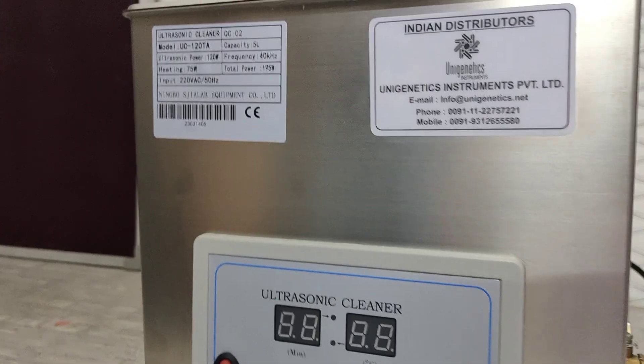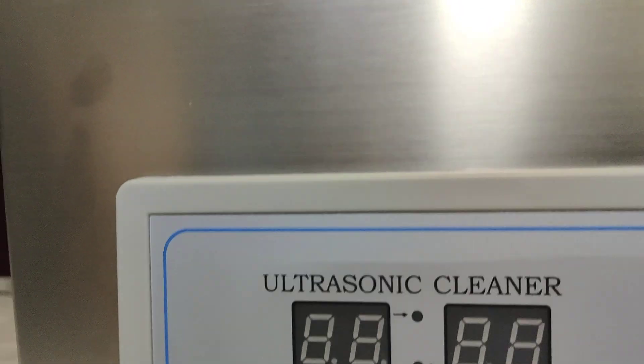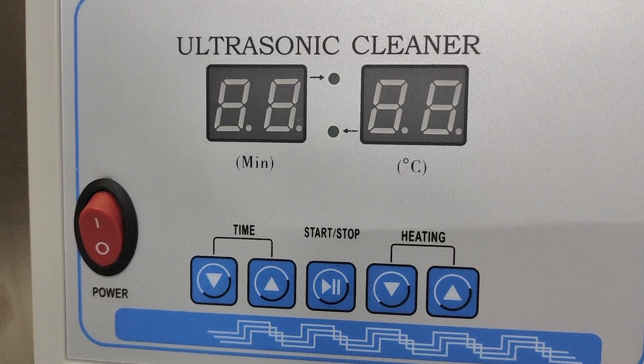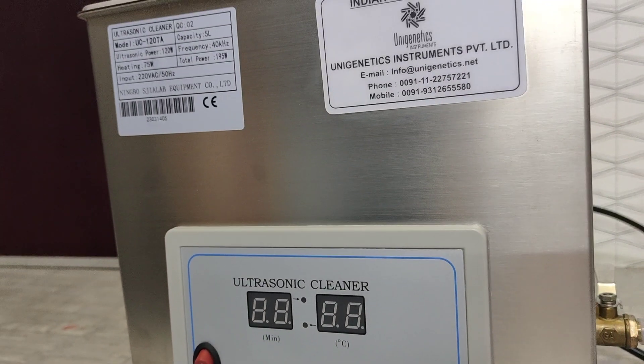Dear customer, this is a machine that we call an ultrasonic cleaner. We are preparing a small video — though it's a very simple plug-and-play machine — so that it helps you run the machine in your lab once it arrives.